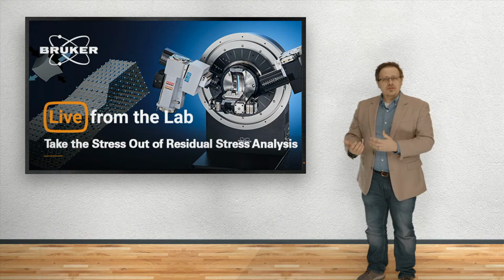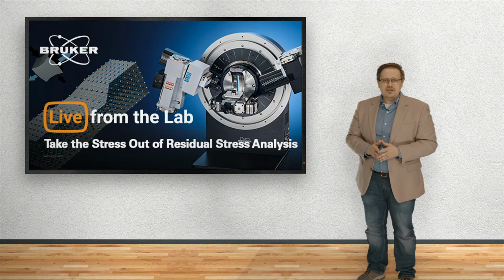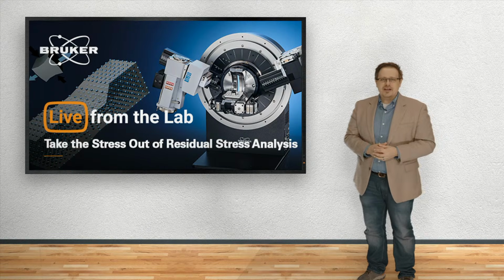So to learn more about residual stress and how you actually perform the analysis, we're going to head on over to the table and talk with one of my colleagues.